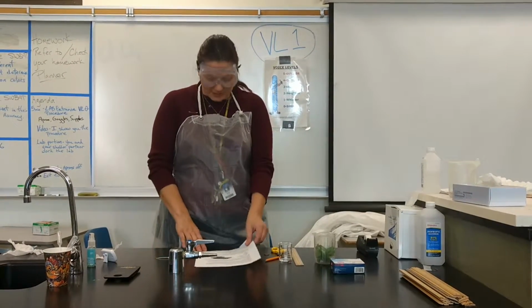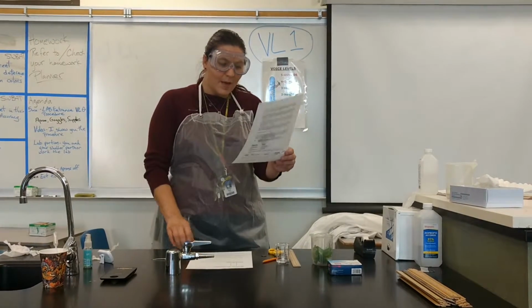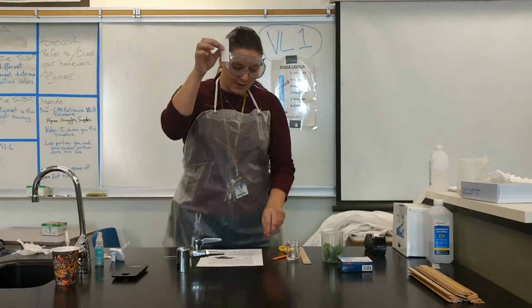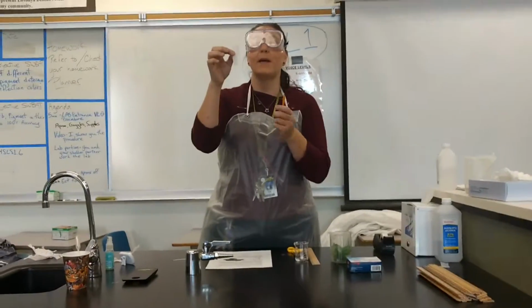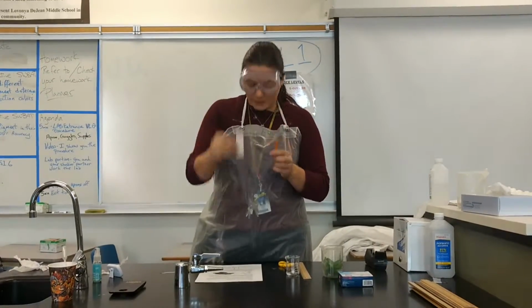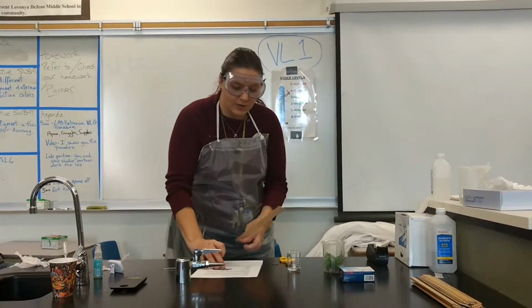The first thing for my procedure is to measure 1.5 centimeters from here. Now I have to use a pencil and not a pen because the pencil does not transfer the pigment. So we're going to go ahead, take this. Go ahead and watch what I'm doing, Matthew.